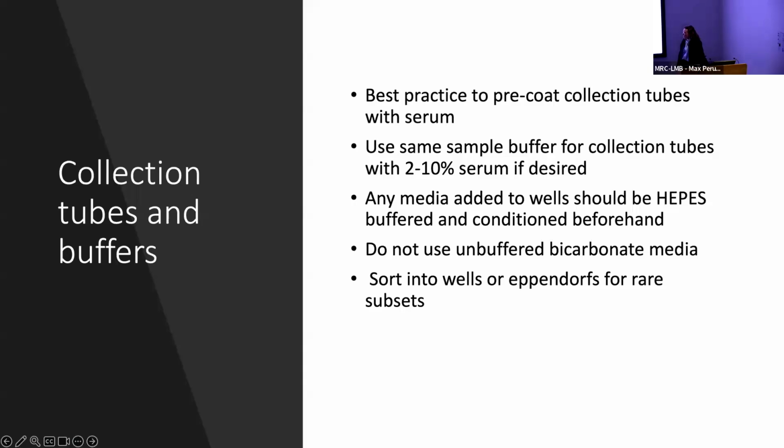We mitigate that a little bit on the BigFoot sorters by applying what's called polarity flipping. Essentially on the BigFoot sorters, we can swap the charge throughout the sort so that the net charge in the collection device is neutral.